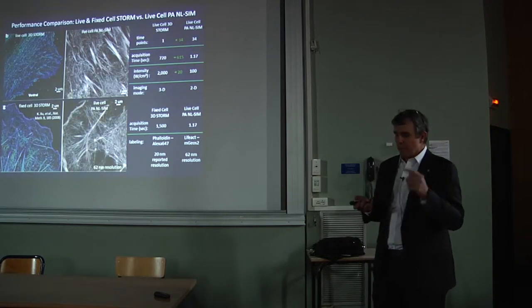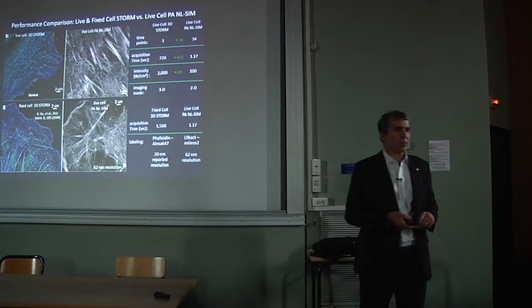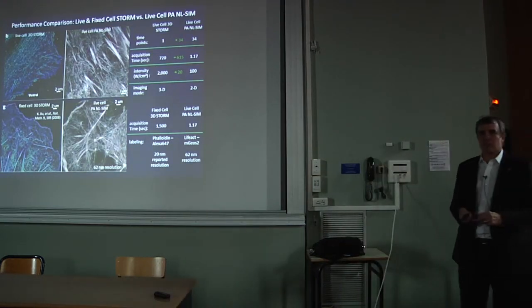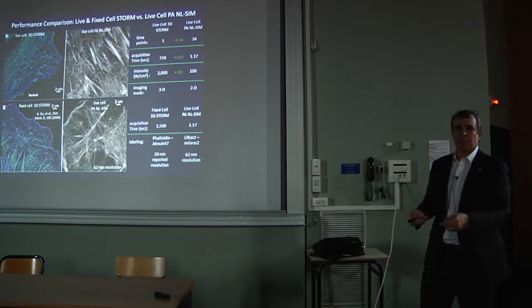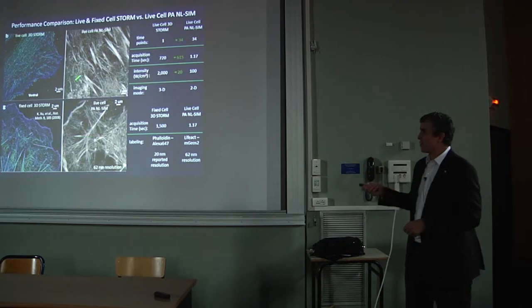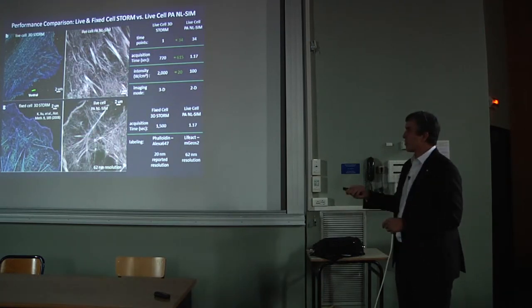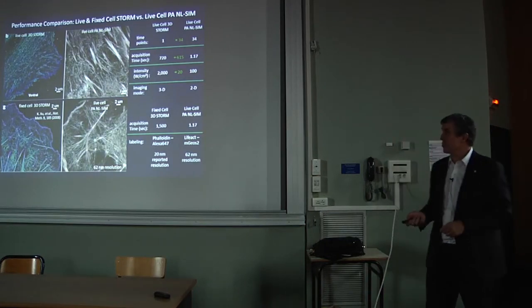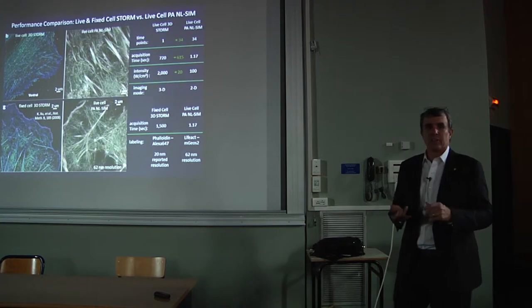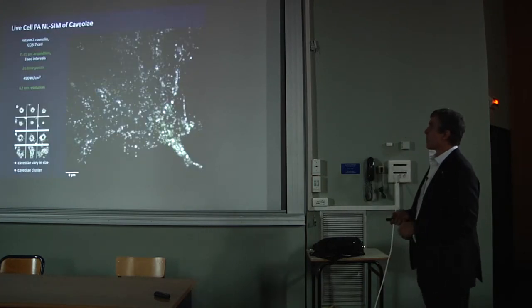So if the reason the Nobel Committee didn't give the Nobel in part to SIM was because it didn't have resolution good enough to really be in the same ballpark as STED, RESOLFT, and localization, this is to prove them wrong, and that's not the case. SIM can be every bit as good in resolution and vastly superior, orders of magnitude superior, in terms of intensity and speed of acquisition.